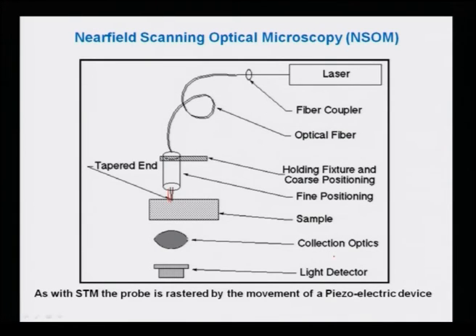As with the STM probe, this is also rastered using a piezoelectric device. This probe is nothing but a tapered optical fiber that is rastered using a piezoelectric device, because that movement needs to be controlled very precisely.